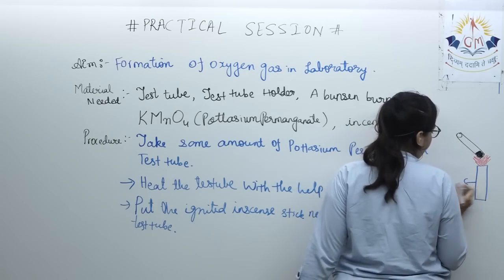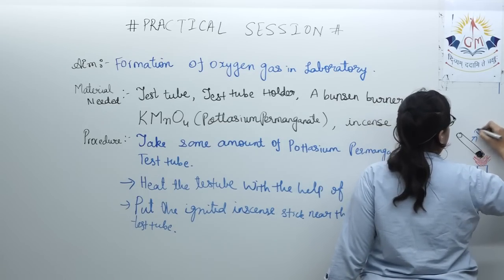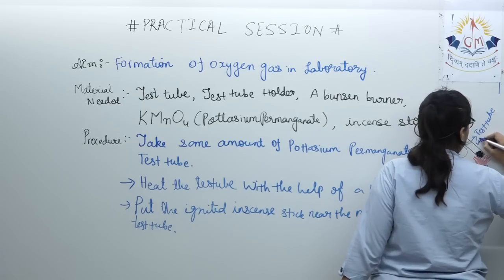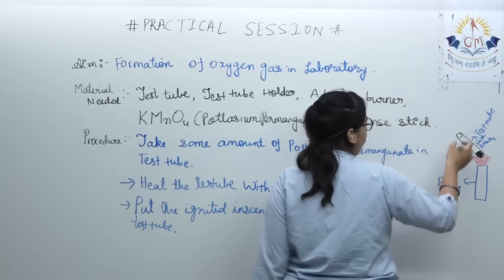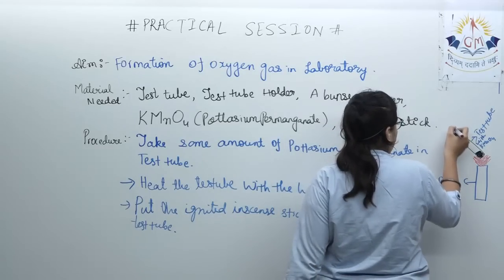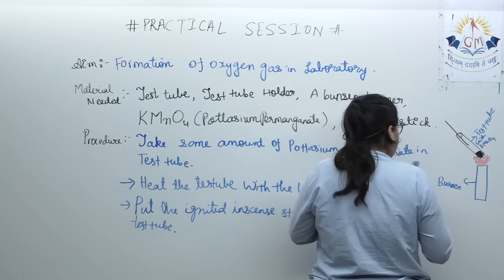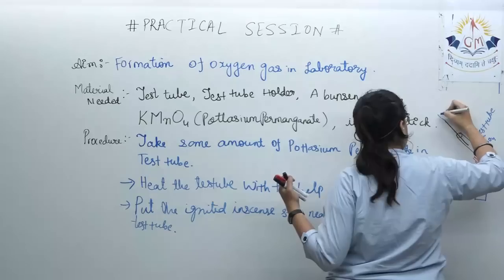This is the burner. This is a test tube which is containing KMnO4. Here we will put inside this one ignited incense stick.